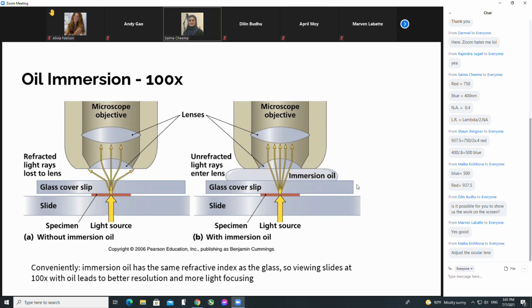Okay, so you want to be able to see bacteria, and the maximum really that you can see is their shape, arrangement, and of course the stain that you have applied. We're not going to be able to see their flagella and pili and things like that unless we somehow deposit salts on them to make them look thicker and so on.